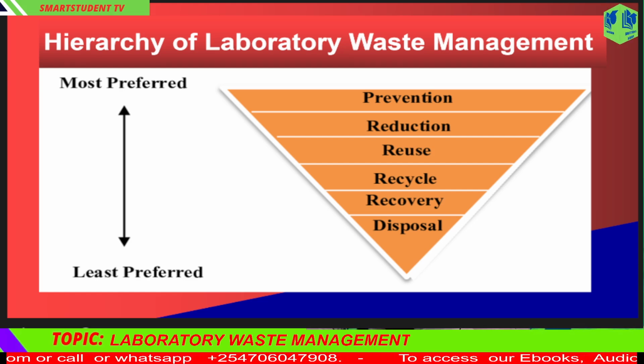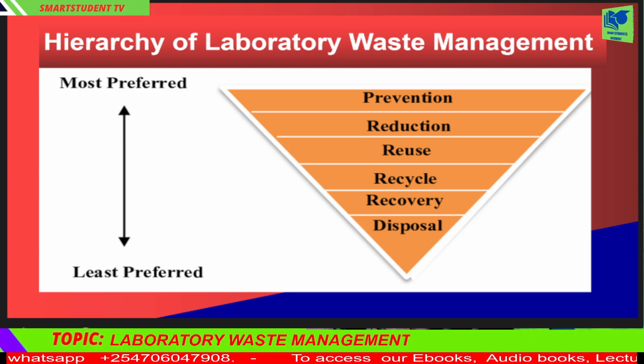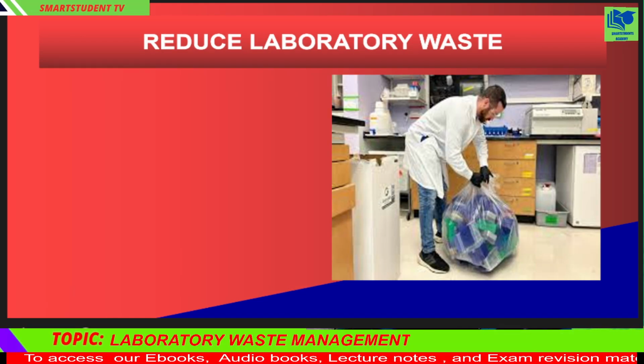Nonetheless, the overriding principle governing prudent laboratory waste management is that no activity should begin unless a plan for the management of waste, whether non-hazardous or hazardous, has been formulated. How to reduce laboratory waste. In order to minimize the amount of hazardous waste presented for disposal, it is important to follow these guidelines.